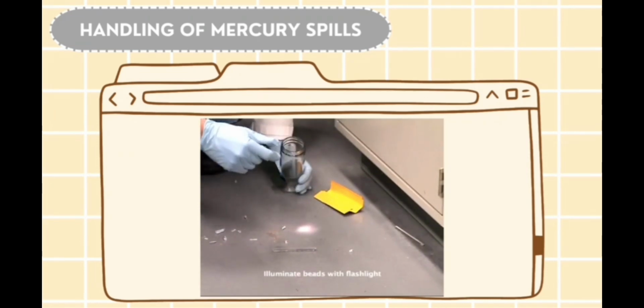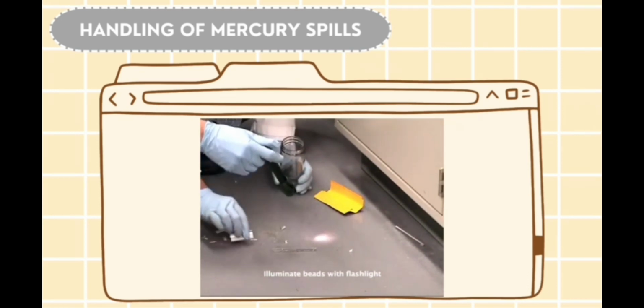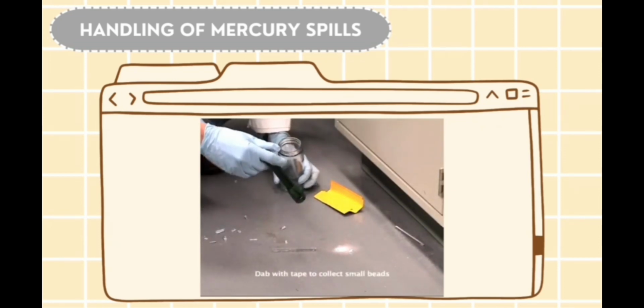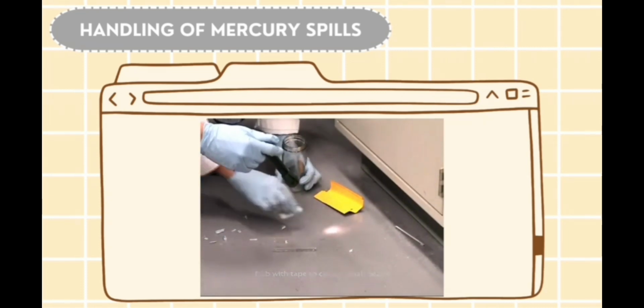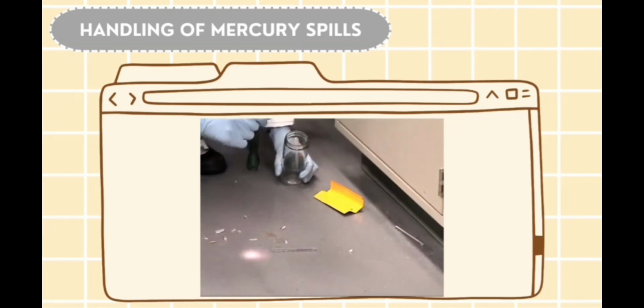Now, some people are really afraid of mercury vapors, but this is such a small amount, and we got it contained pretty quickly. I think that we don't have much to worry about in that regard, but we don't want it to be sitting here in the lab for extended periods of time. We just want to make sure we get most of it, if not all of it, up, and if we're not comfortable, we'll call EH&S.